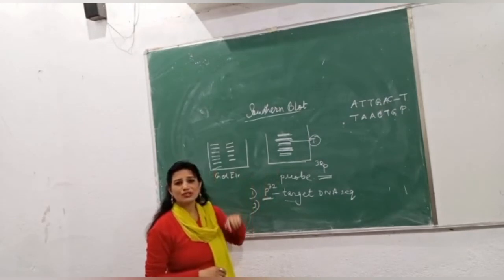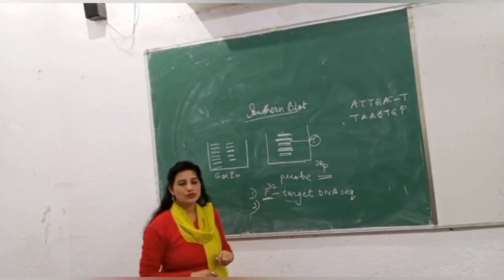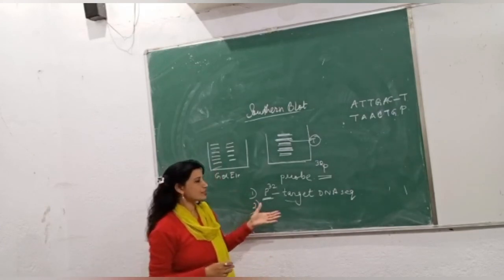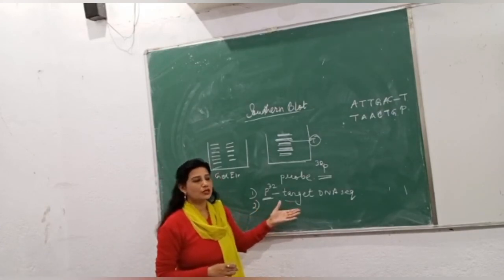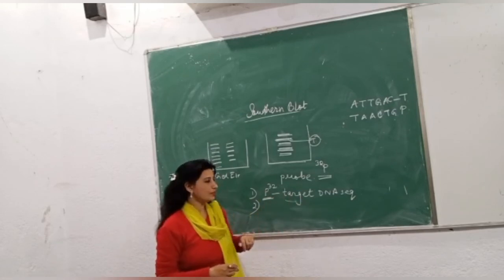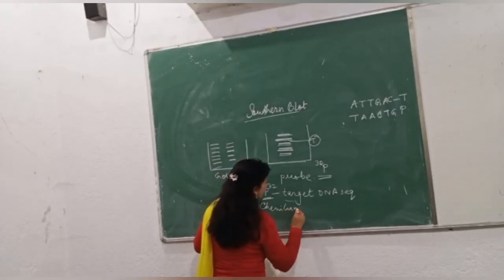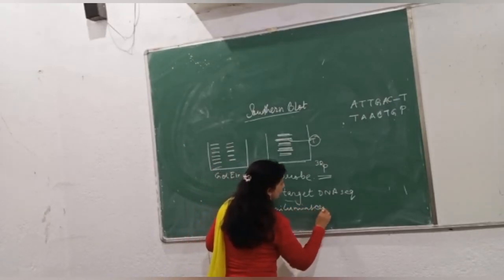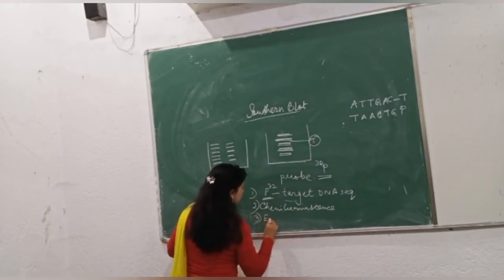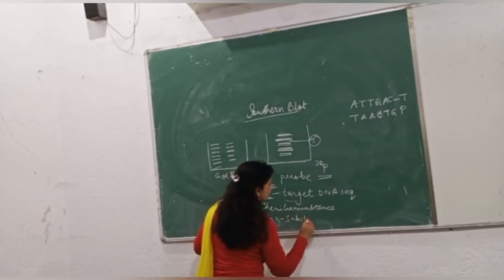And there are some other ways also. You can use chemiluminescence for this purpose. There are some chemicals which will help you to understand which is the target DNA sequence of a molecule, by giving some light when exposed, so chemiluminescence is also there. Another is a particular enzyme which is used, and this enzyme produces light when it is combining to the substrate.